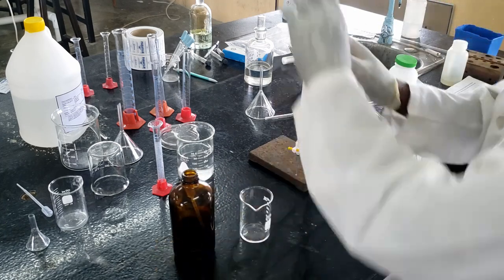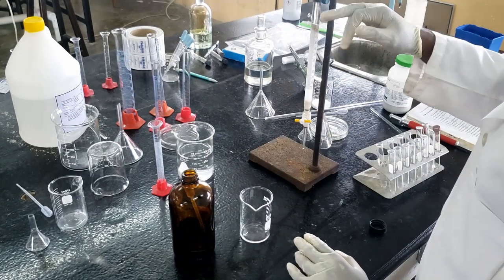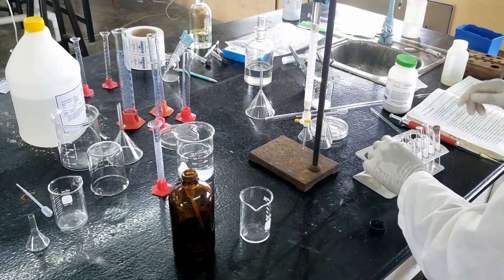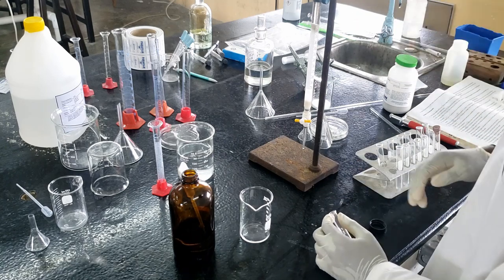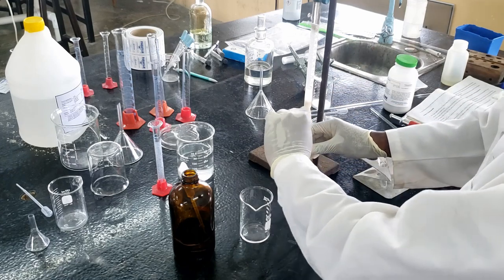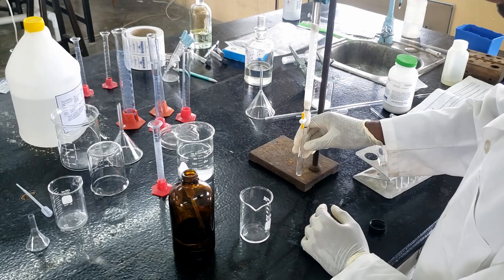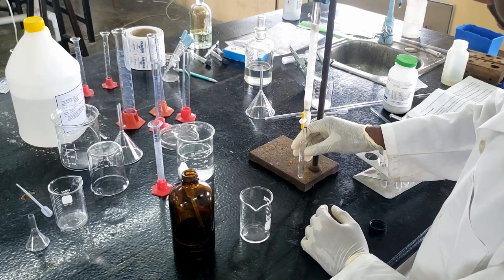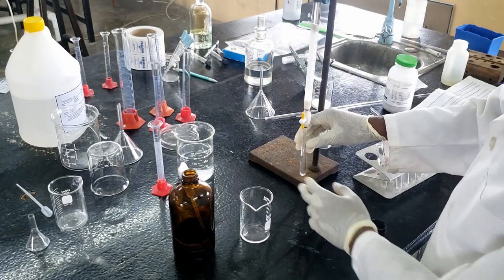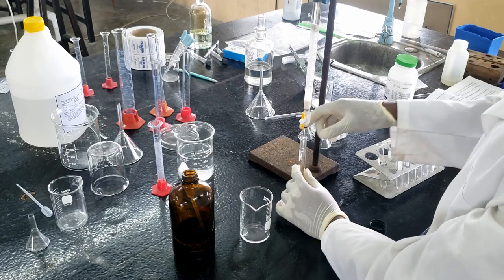Now what's important in this phase is that we do not let the eluent solvent level drop below the level of the sand. So we're going to keep filling it up. If we use too much, fill it up again and continue. Now the rate will be pretty slow. It'll go drop by drop. But like I said, every 5 to 8 mL we stop, start a new tube. And every fifth fraction, we're going to test.